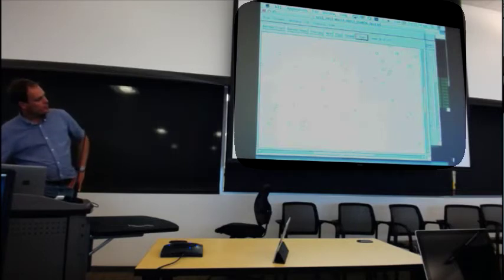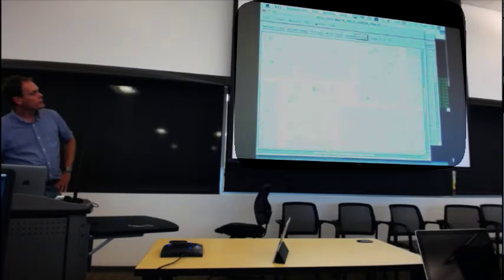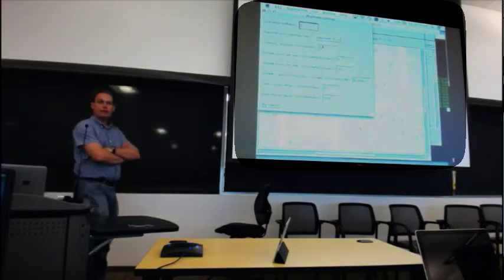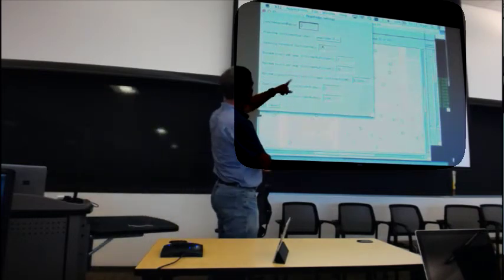So it's missing a couple of peaks, you can see here. The question is whether it's worth changing the peak finding settings or if this is okay. I re-implemented the peak finder that's in Cheetah within the GUI. At the moment this is circling the peaks that were found by Cheetah running on the batch node. You can switch it over to showing the peaks found by the viewer and then go in here. These are exactly the same numbers that you type into the Cheetah peak finding. It comes up with a few options here.